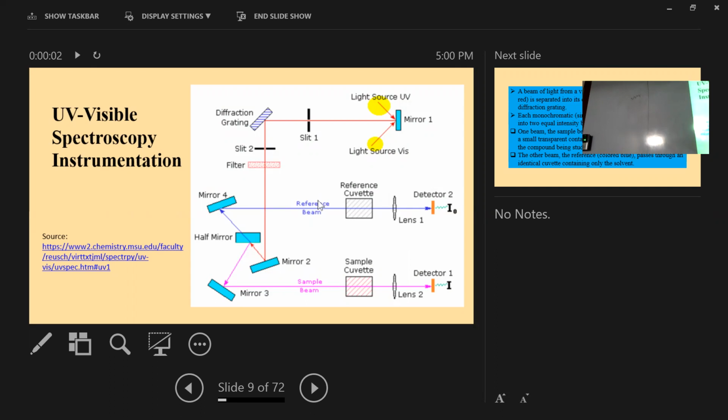If we have more amount of sample, we have mentioned how much light we are detecting here. That is the amount of light that has passed through, the remaining after absorbing. We have given the light from here, some of the light is absorbed by the sample, and the rest of the light goes to this detector.